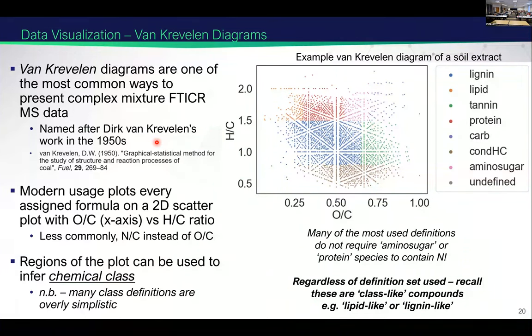If you look at the whole spectrum and there's 10,000 peaks, it's hard to figure that out. But in this plot, you can actually see how they fall chemically. There's also these putative annotations, whether it's a lignin-like molecule or a lipid-like molecule. And we'll talk a little bit about that more, but suffice it to say, and this is the tricky bit, we're not saying that that peak is a lignin molecule. We're saying that that peak falls in the same area as a lignin-like molecule would fall. And so we can infer that it's like a lignin molecule. We can't say it is a lignin molecule.